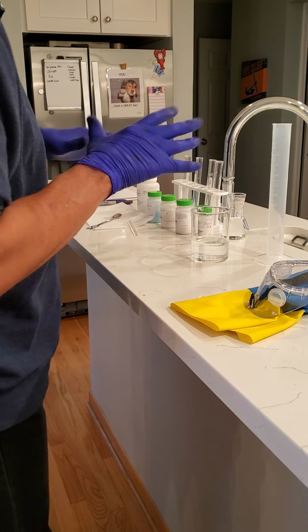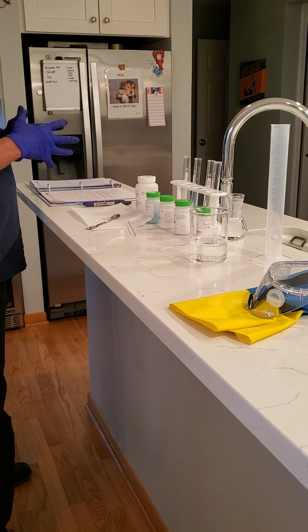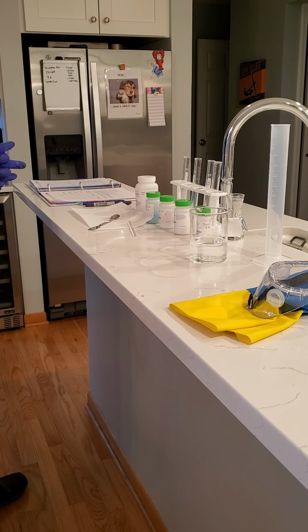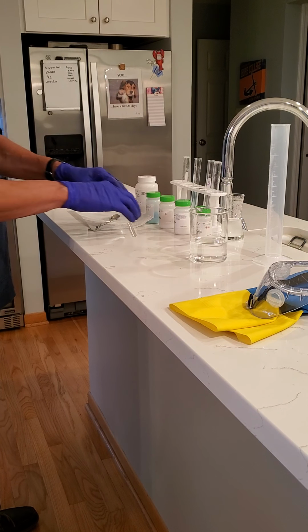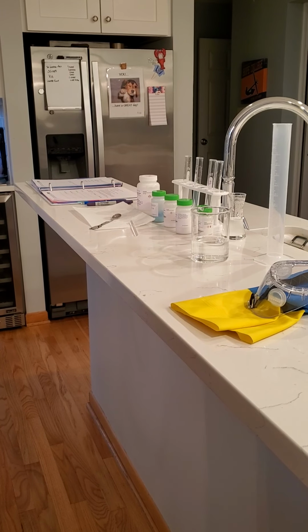And then we're going to let those sit for a few minutes, make our initial observations, and then after about 5 or 10 minutes, let's say wait 10 minutes, then come back and make some other observations after they've had a chance to sit for a few minutes. And then you'll kind of rank or notice how soluble each of these salts are in water. Okay? And so then you make your observations, and we'll go from there. So don't forget to do your pre-lab, read the lab, do the pre-lab calculations, and then do this qualitative measurement for the various salts. We'll talk about solubility when we go over the lab in class. So that's the qualitative step 1 after the pre-lab.